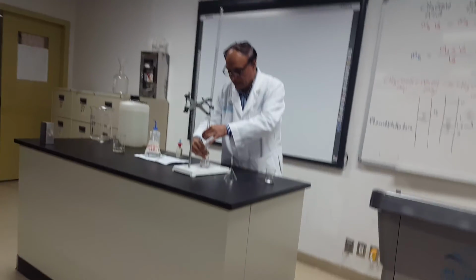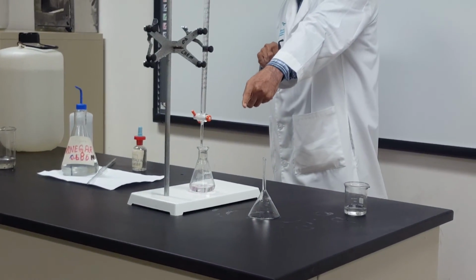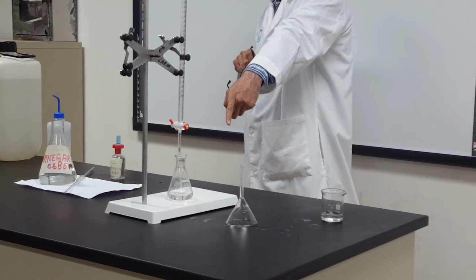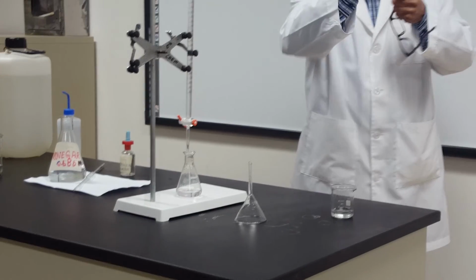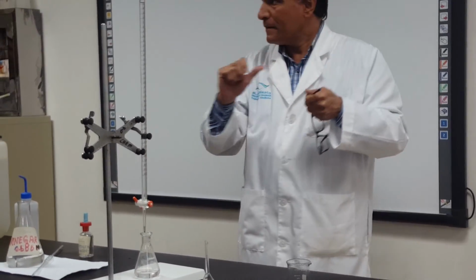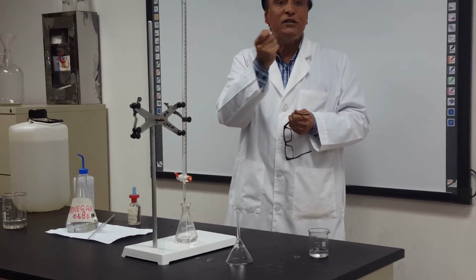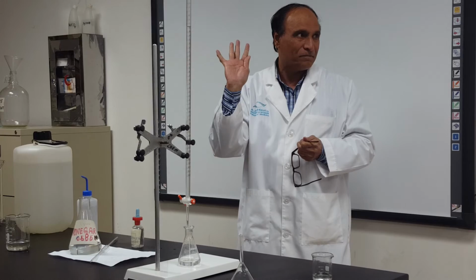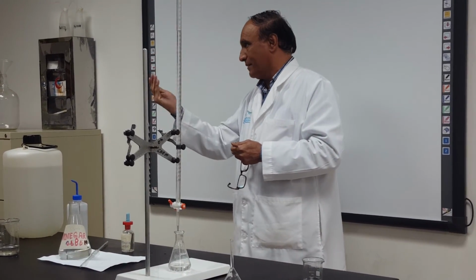And now if you see, the color is not disappearing. Look over here. There is a pink color. And still it is there. Do you see that one? Yes. It disappeared with delay, late. What does it mean? The end point is close. Very good. It means the end point is close, which means that I should not be very fast. Slow. Even slower. It was drop wise, now I will be more slow.